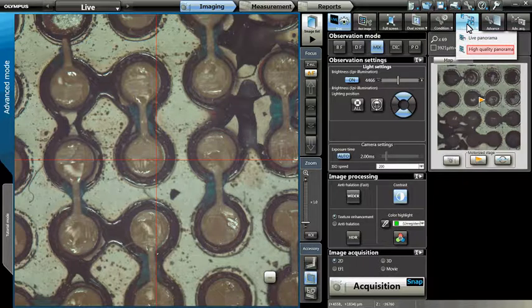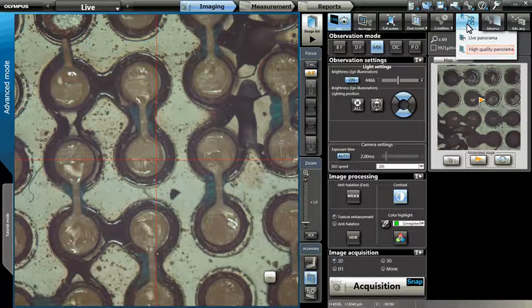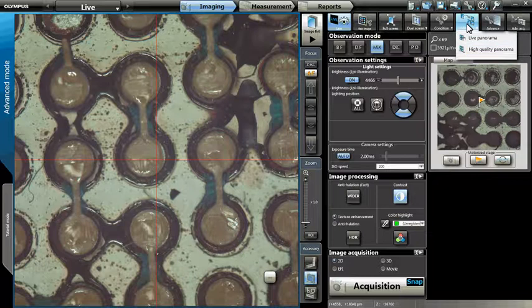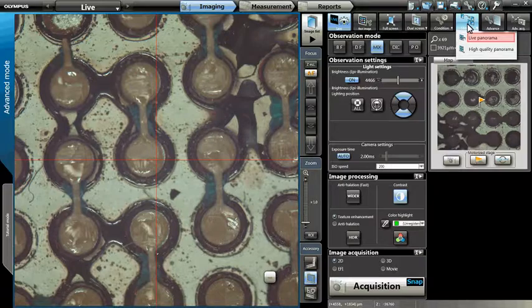High quality panorama utilizes the motorized stage to stitch together a preset field of view. Please view the video for high quality panorama for more details. For this example, we will be performing a simple 2D stitch by selecting Live Panorama.